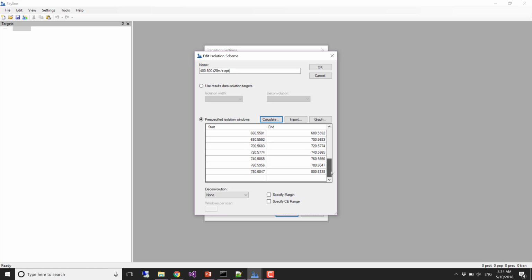So we click OK here, and now you can see that the boundaries are all these weird numbers, and it turns out that molecules are built out of atoms, and atoms have certain units. Jarrett used to say it's like building a building out of Legos. There are certain units, and you're not going to find something 3/4 of a Lego in size. So these are well optimized. Although charge state changes where things fall, and so if you get up to higher charge states, these won't necessarily work.